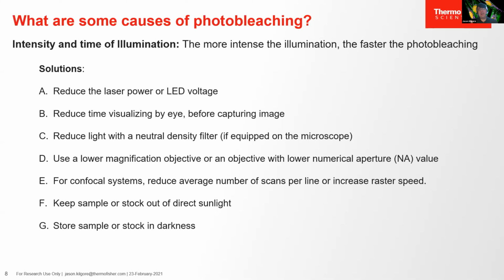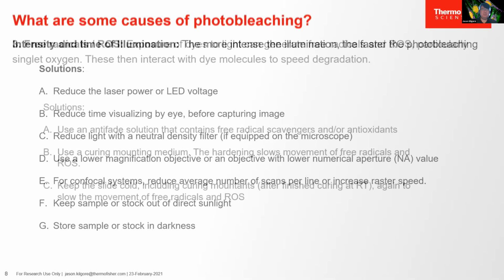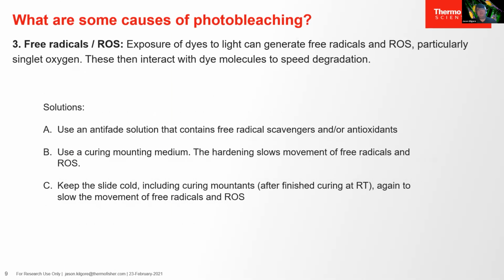And if you're storing your samples in a refrigerator, make sure it's not glass fronted unless the dye is in a box or covered with aluminum foil. Also, free radicals or reactive oxygen. When you expose your dyes to light, you're generating these species, especially singlet oxygen, and this will interact with your dye molecules to speed the degradation.